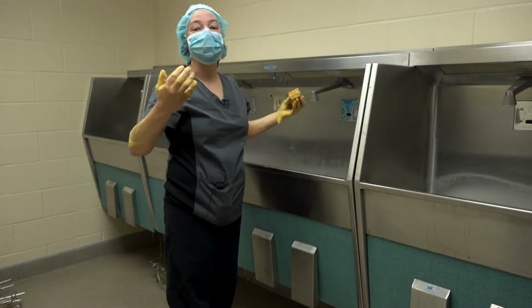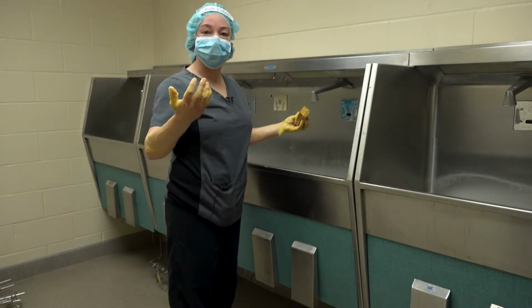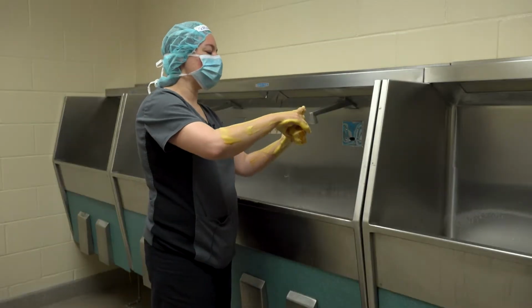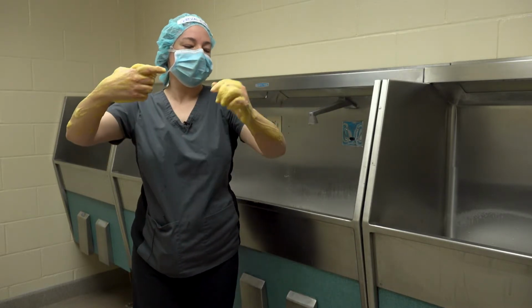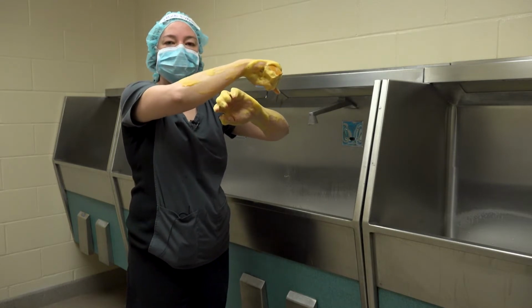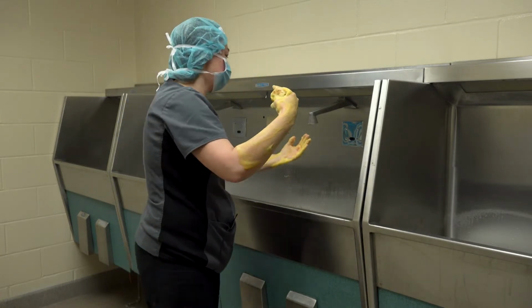And through the magic of TV production, we have gone 5 minutes. So isn't that awesome? So now we're ready to rinse. We're gonna start at our tips and go down to our elbows, because our elbows are still dirty. Look how dirty my elbow is. Since my elbow's dirty, I don't want any fluids running from my elbow down to the tips of my fingers and contaminating my fingers. So my tips of my fingers are gonna stay up this whole time.